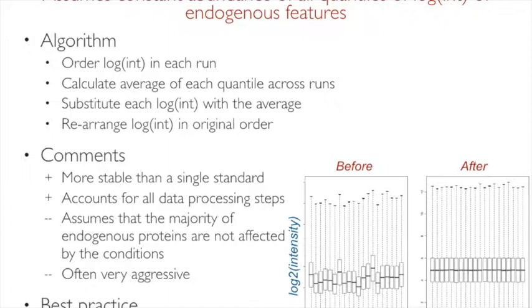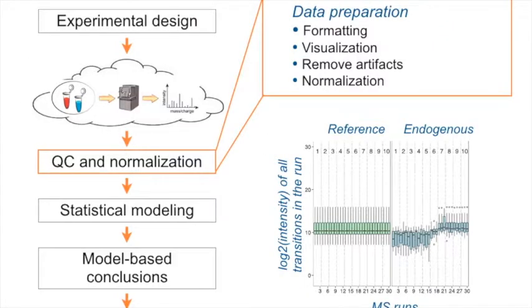If the distribution is very skewed, for example, you have many proteins which have very large values, but the other proteins are very concentrated in one area, then the median will be smaller than the mean. So it's not really in the numbers. Remember we talked about this last week, that we can compare mean to median as a measure of skewness, right? So the mean will be here, but the median will be here. And it doesn't matter how many data points you have. So your box plot would look like this. And we actually have these examples here, I think. Yeah, you have some box plots here which are very skewed, right? So the mean will be very much affected. It doesn't matter how many data points, it's more what the skewness of the distribution is.